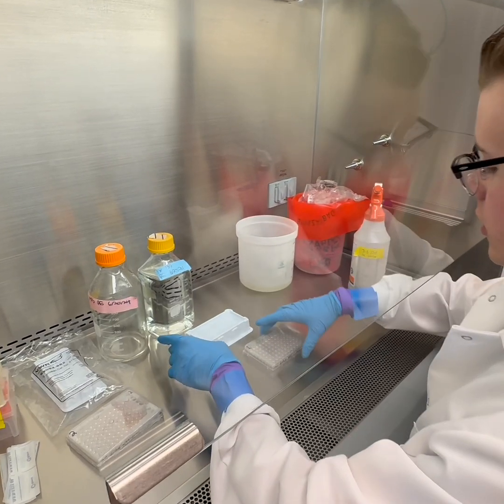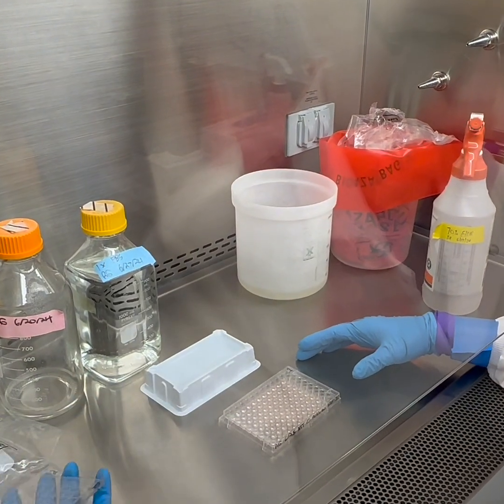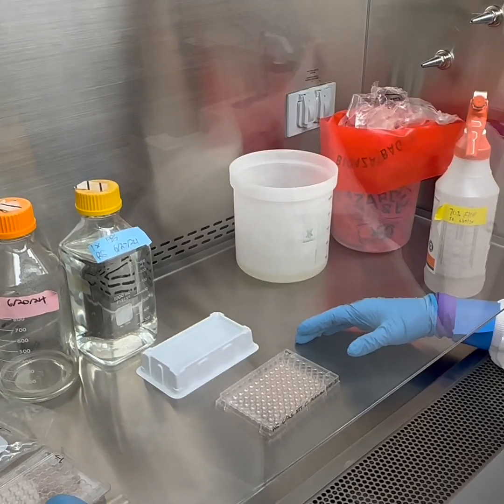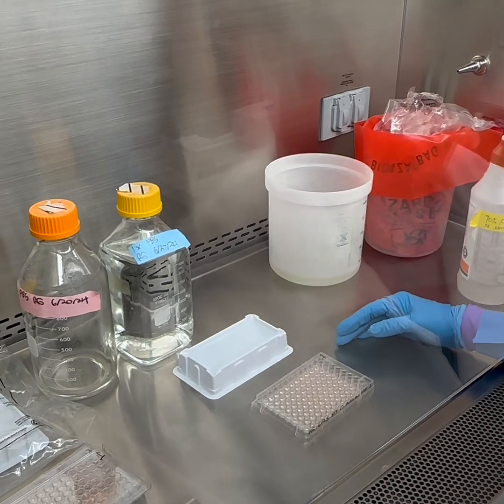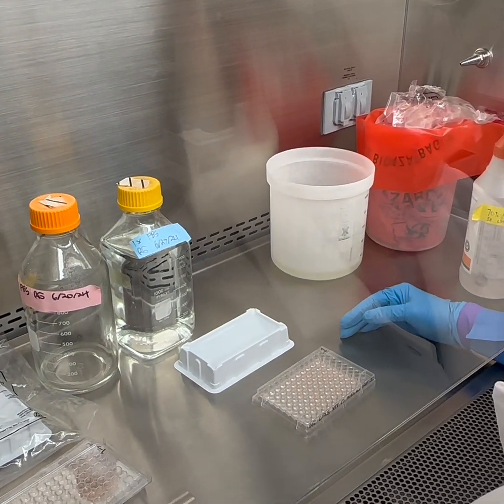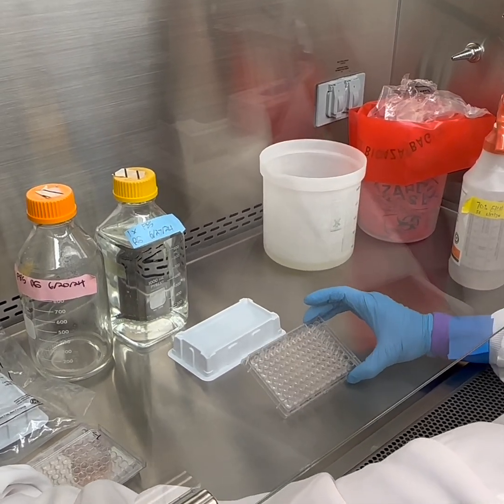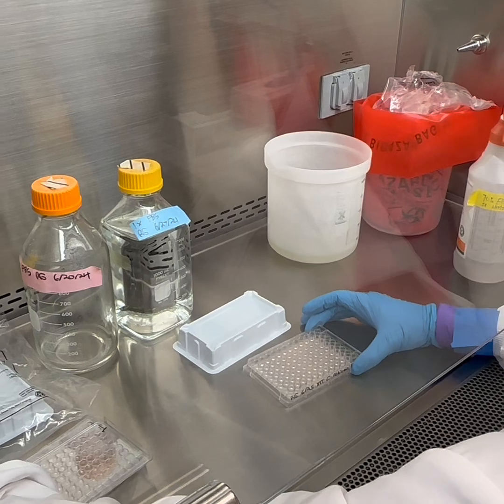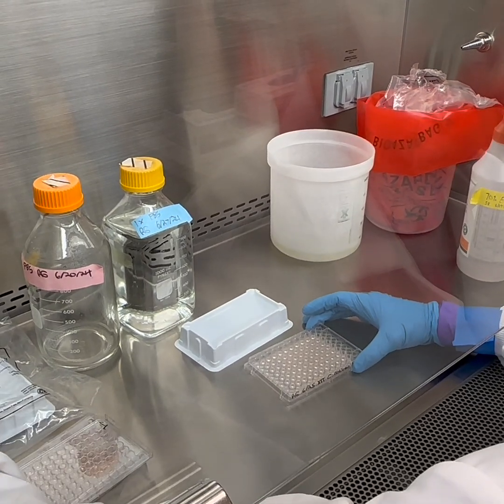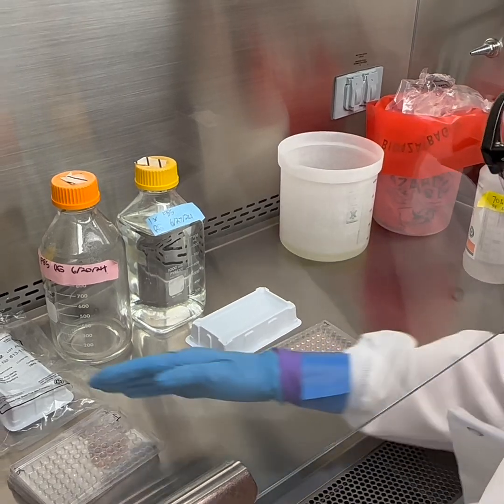Alright folks, so we are back after our 24-hour incubation with our serially diluted compound. So in this case for me it's heparin. There should be a gradient of inhibition. It's probably going to be hard to see before we add the colorimetric XTT.